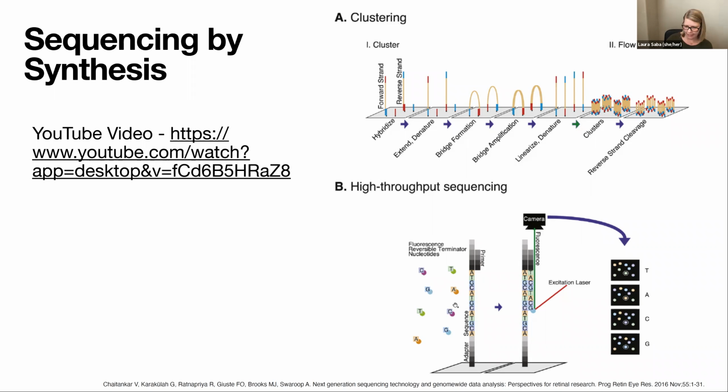They call it sequencing by synthesis, where as they add the matching base pair, they get this fluorescence, and then we read the color of the fluorescence to be related to the base that it's detecting. And so it starts at the beginning and just looks for different flashes of different colors. So that's a very broad overview from a non-technical expert. But the idea is, in the end, we know this sequence of nucleotides that are matching our originally tethered piece of RNA or processed DNA.